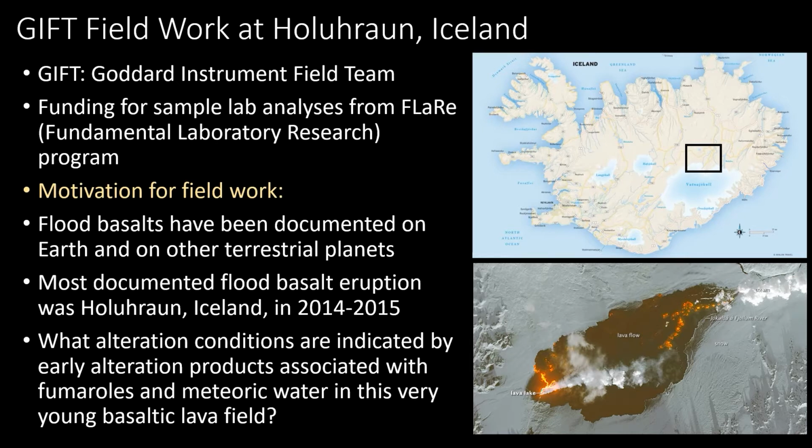And so the sub-team that I was involved in was interested in what alteration conditions are indicated by early alteration products in this very young lava field, associated with fumaroles and meteoric water that had interacted with the basalt in this lava field. And so we set about using our portable instruments in the field to start trying to address that question.